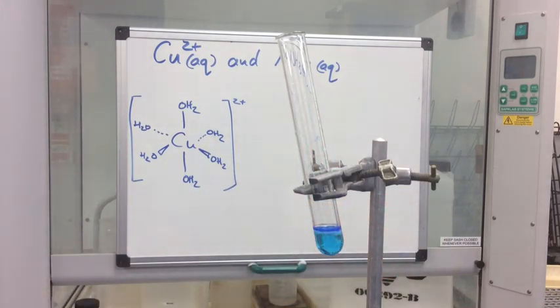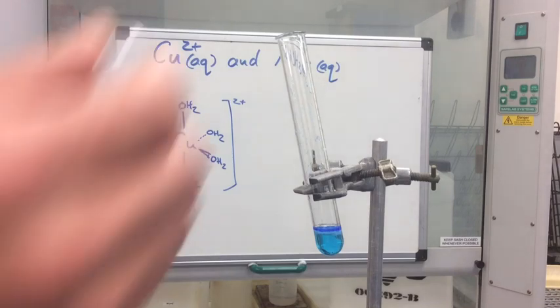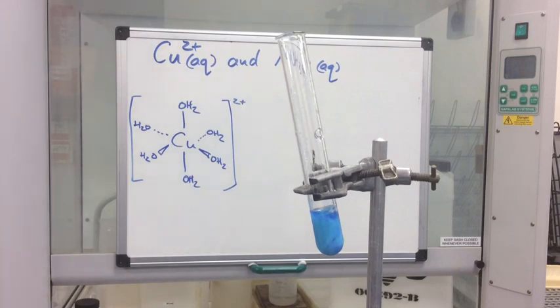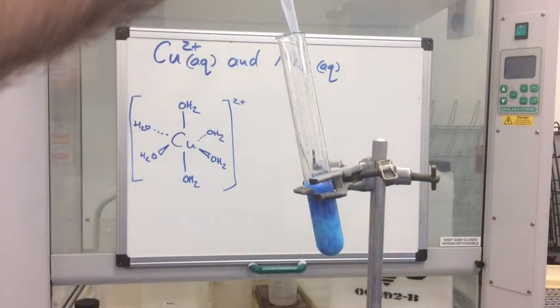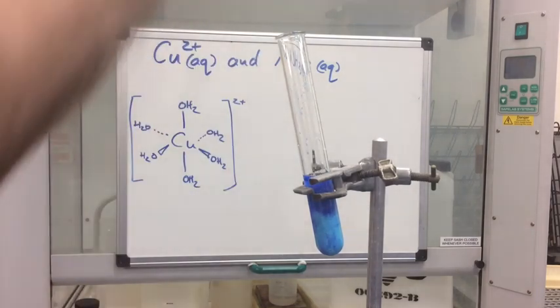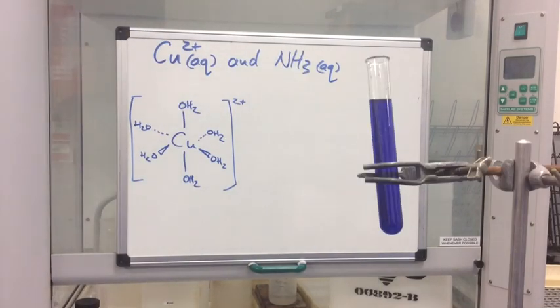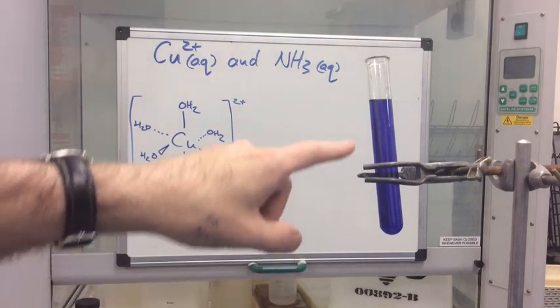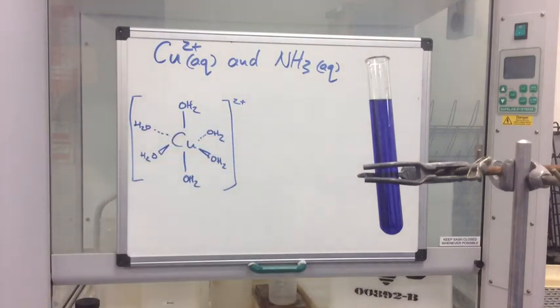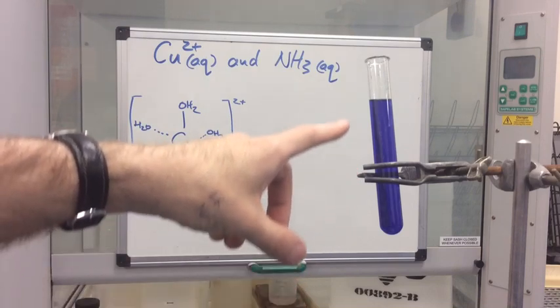Now I'm going to flood this with more aqueous ammonia. You can see the precipitate very clearly, and as I keep adding it's getting darker blue. I've added more ammonia and given it a good shake, and you can see that the blue precipitate has completely dissolved and we've got this nice deep blue coloured solution formed in the test tube.